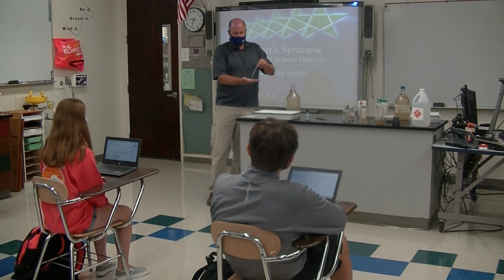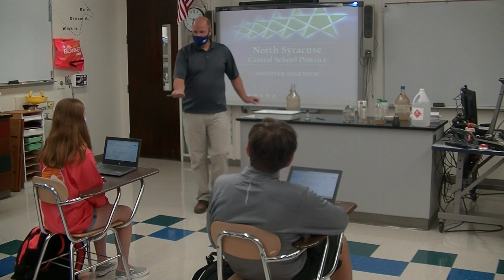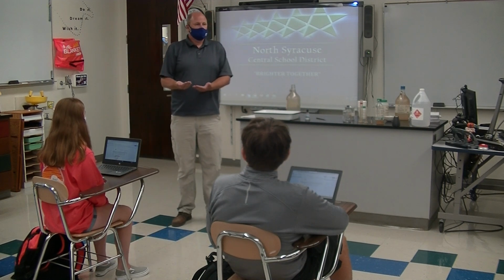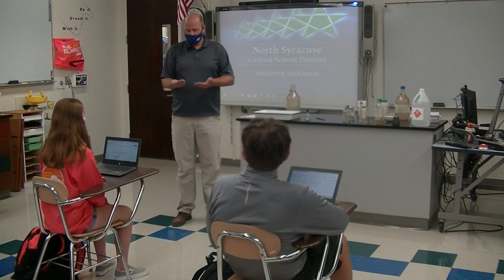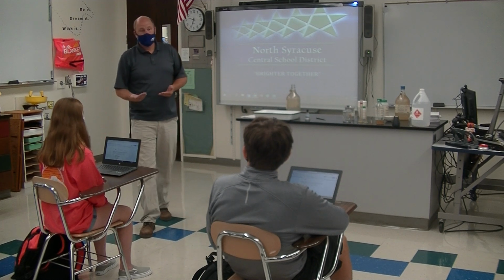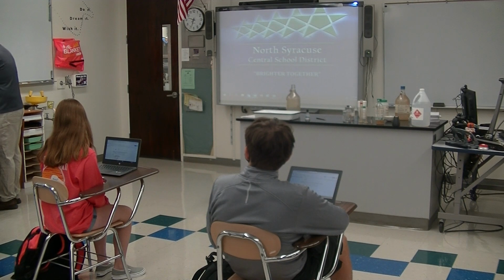If you get an acid on you, I just put concentrated sulfuric acid on my hand. Can you confirm that it's there? All right. How do I know it's an acid? Burning sensation. I have a warm burning sensation right now. What do I do? Rinse it off with water. Notice it's turning color now, right? You see how it's changing color? So I'm going to walk carefully to the sink, and I'm going to rinse off my hand. I purposely took my time on that to show you.